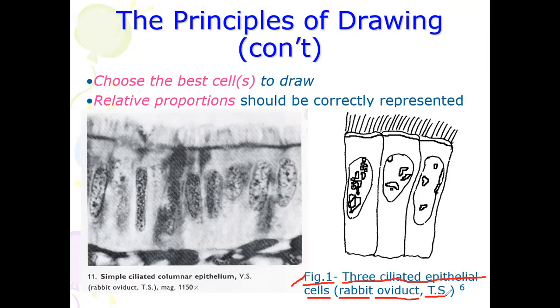So this is a full title. After you draw the whole thing, remember to write a full title there so that in future, when you look back into drawing, you know exactly what this specimen is that you have drawn. Very important. Okay.